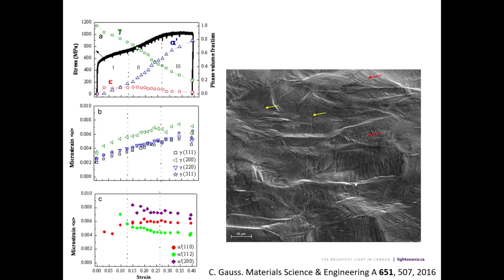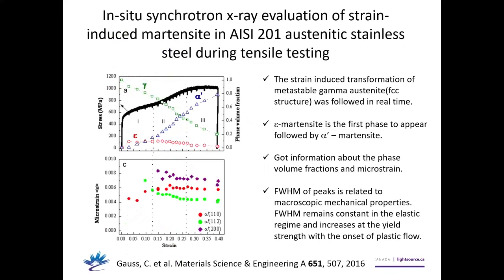Of course, I think XRD is great, but you always want to combine with something else. Microscopy, absorption, that's always useful. Seriously, yes, you want to combine and complement with other techniques.